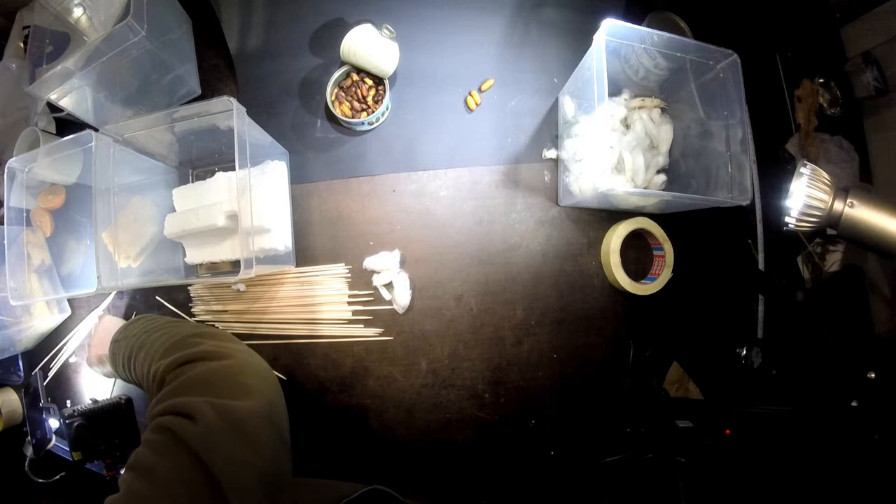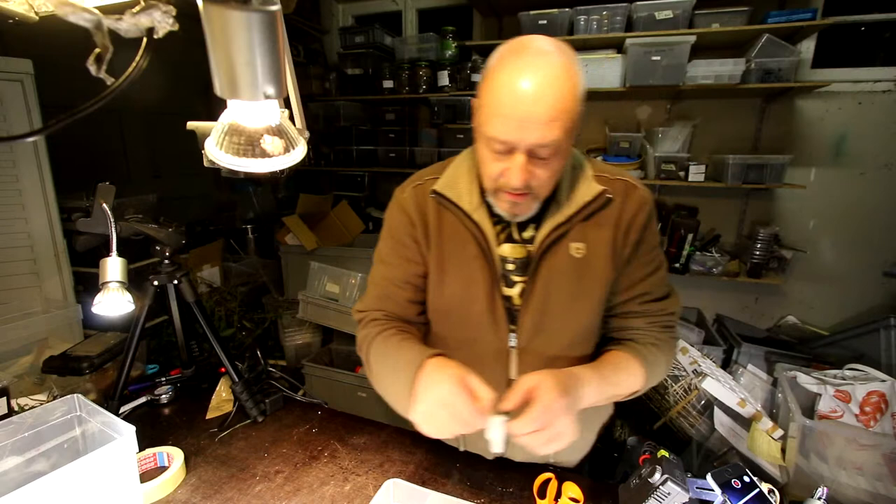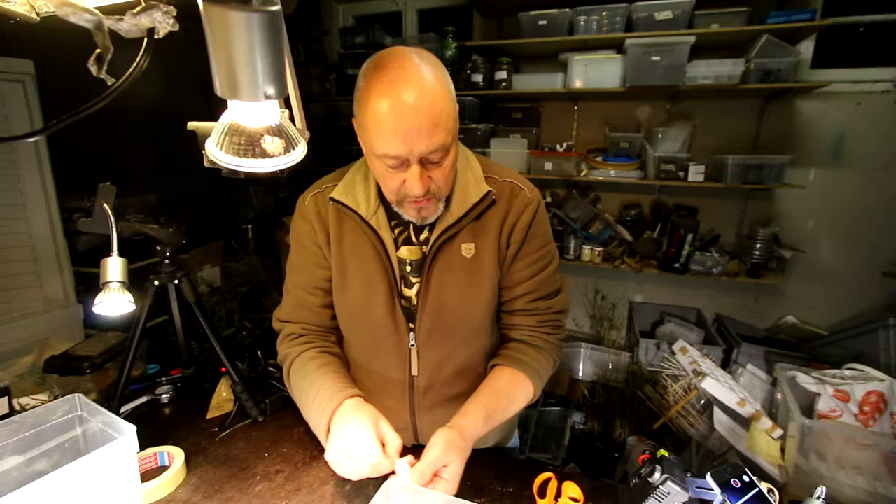What you see here under this lens are two pupa skins — larval skins of the last L5 stage larva. They are very small and very light. It's only a very small and thin construction, this chitin shell around the larva. They don't waste much material to do so, because chitin is such a good material.